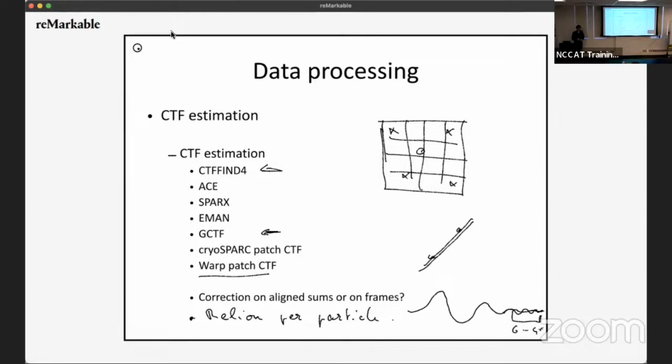Actually, is there a recommended defocus range to use? Because as I understand it, if you use too far of a range, then you're going to get too distorted images at some point. But if you use too small of a range, then you have zeros that are too close to each other. So is there some recommended range so that you get a good result?